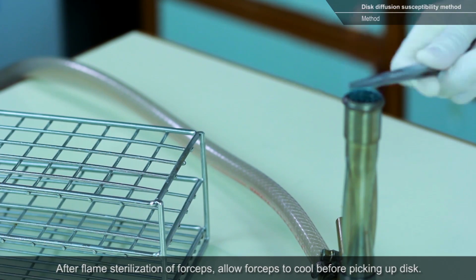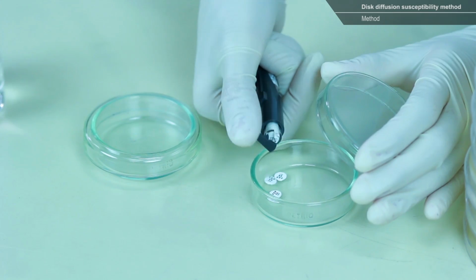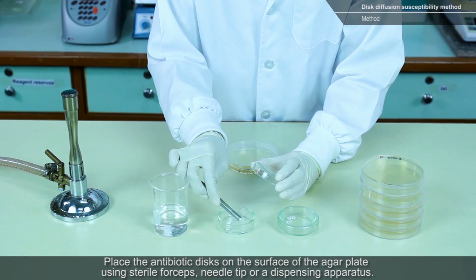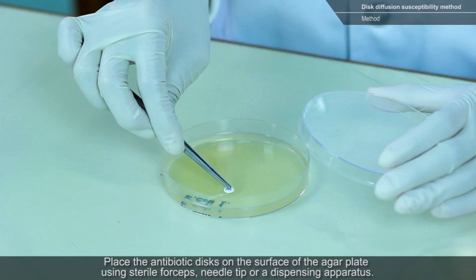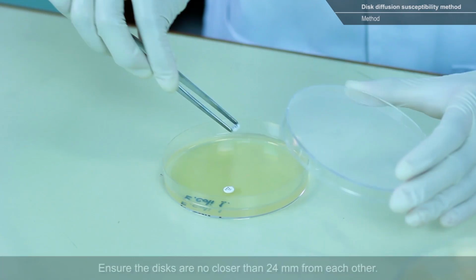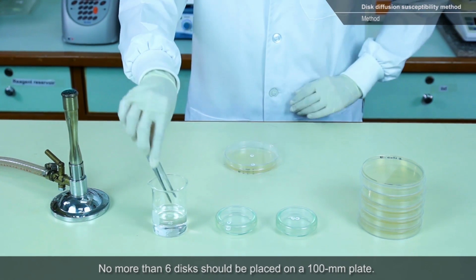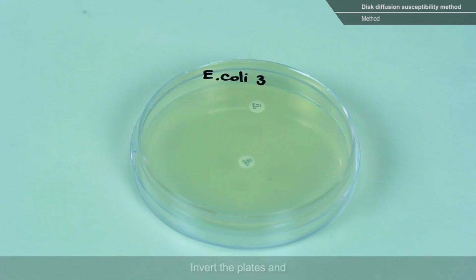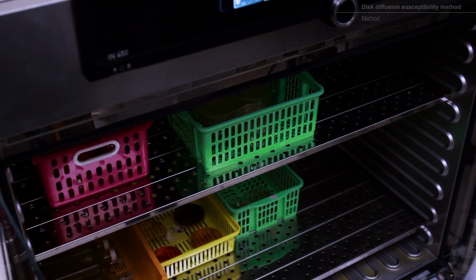After flame sterilization of forceps, allow forceps to cool before picking up the disc. Place the antibiotic disc on the surface of the agar plate using sterile forceps, needle tip, or a dispensing apparatus. Ensure the discs are no closer than 24 millimeters from each other. No more than 6 discs should be placed on a 100 millimeter plate. Invert the plates and place in an incubator within 15 minutes after the discs are applied.